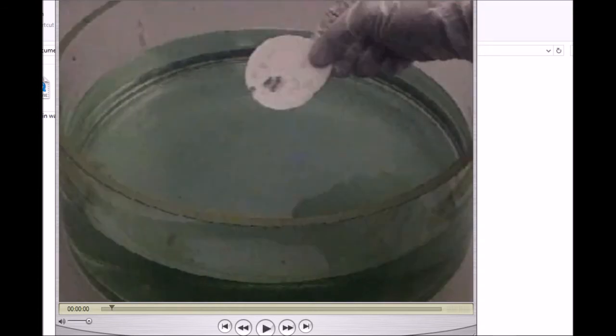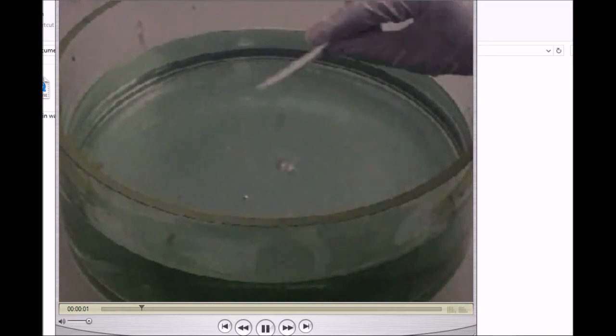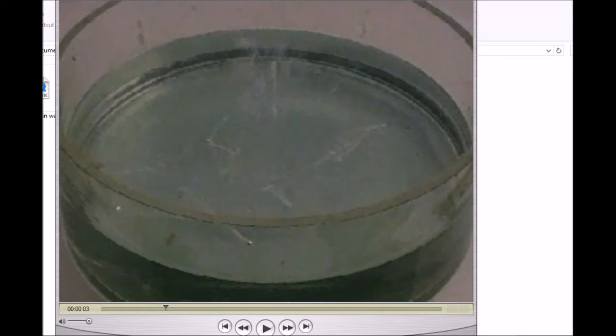So first thing you should have noticed was, of course, it floated. The second thing you should have noticed was that it ignited with that sort of lilac-y purple coloured flame. Really, as soon as it hit the water, unlike the sodium, which required someone with a lit splint to come in and light it. So it's really very, very exothermic. Loads of heat given off. The hydrogen gas actually just ignites itself because it's so hot. Hard to see the indicator turning purple there, but it does. Certainly floats. Certainly the metal again disappears and dissolves. So the product again must be soluble.